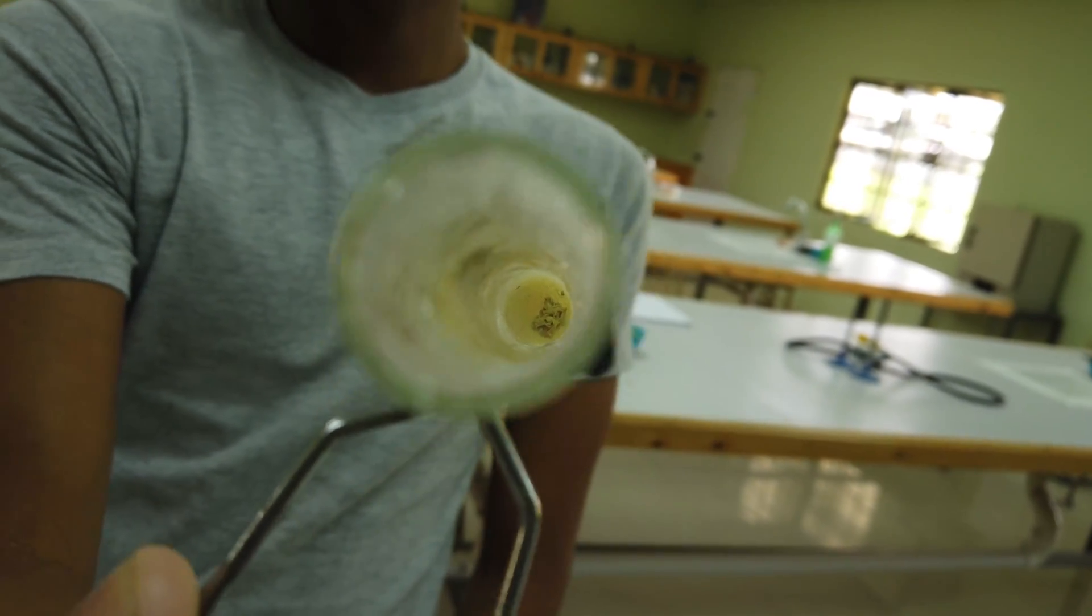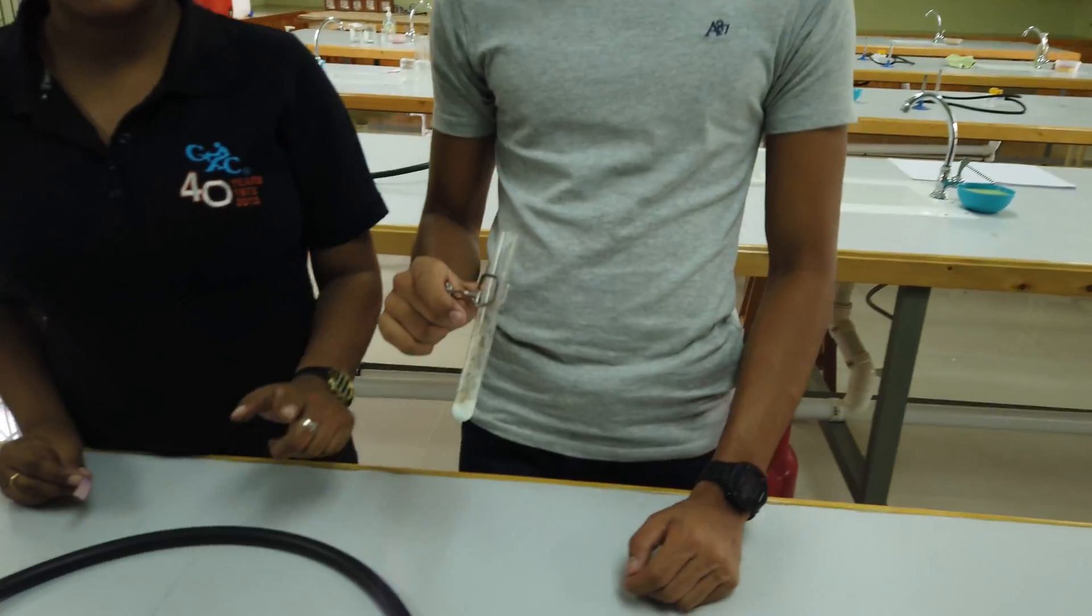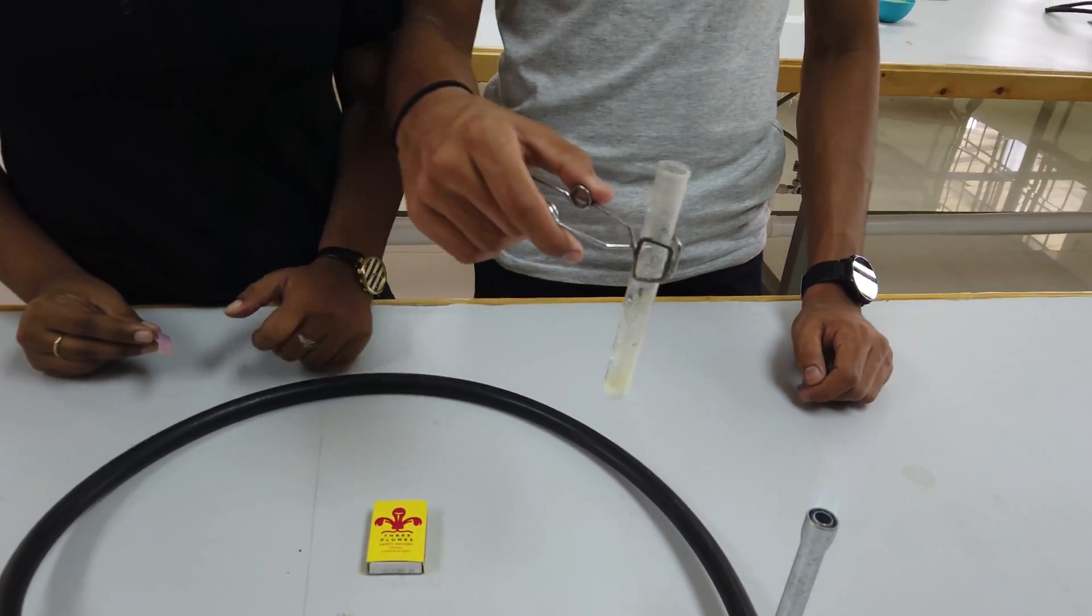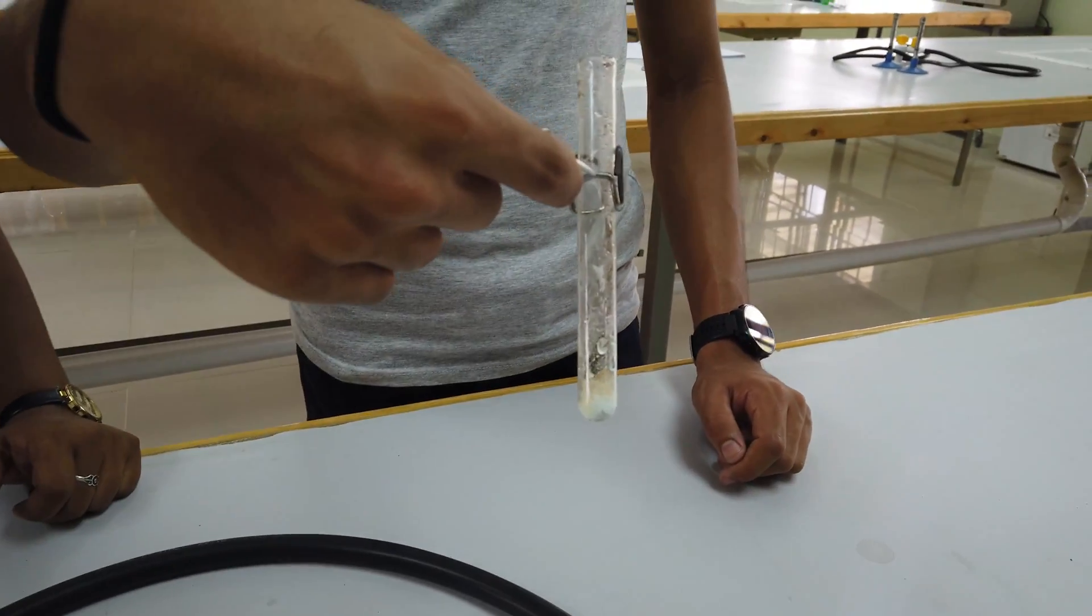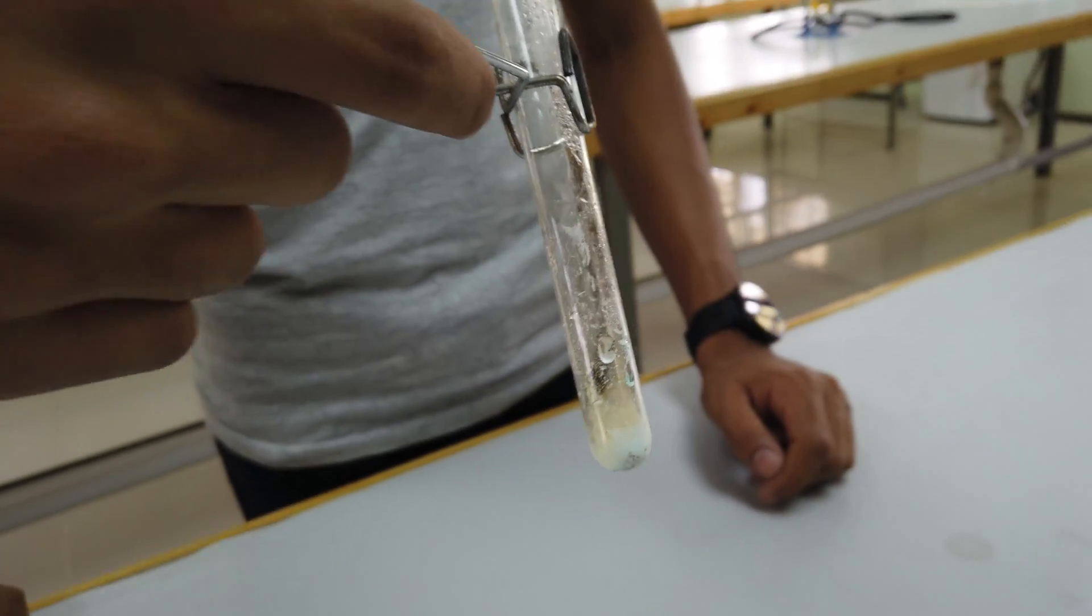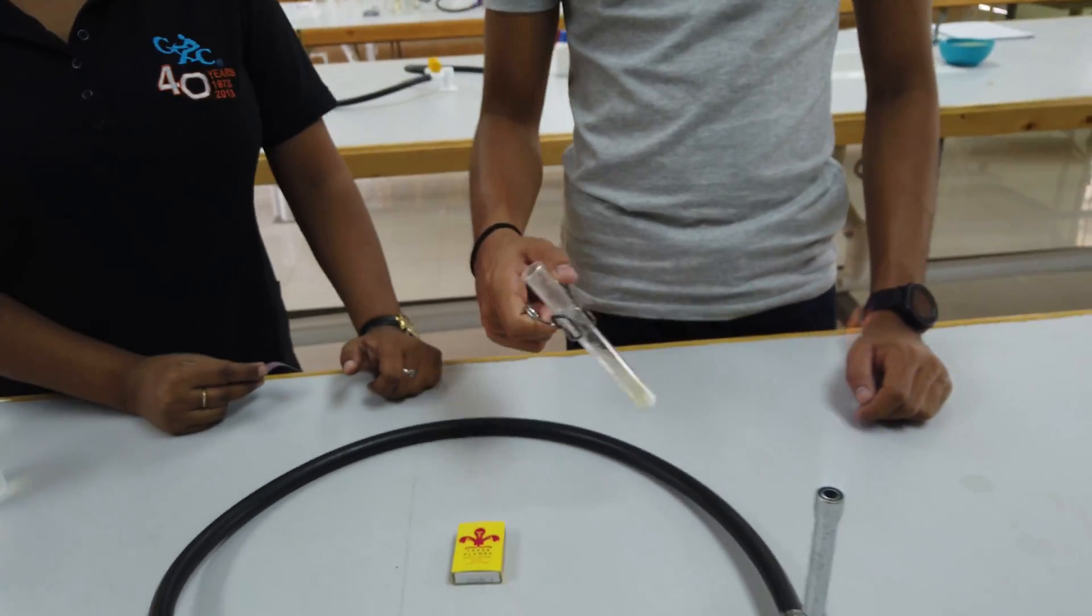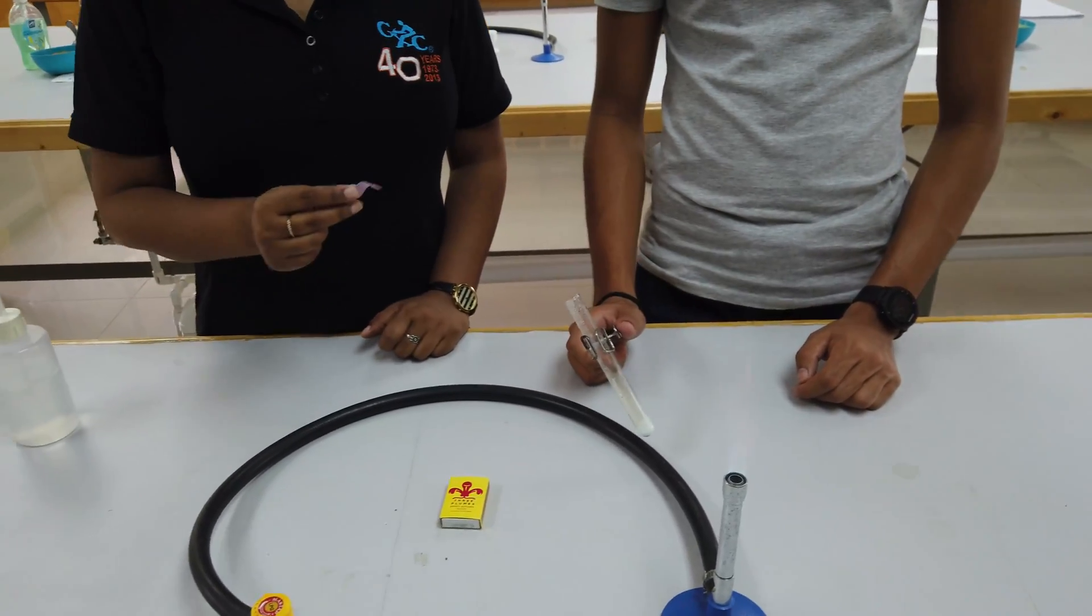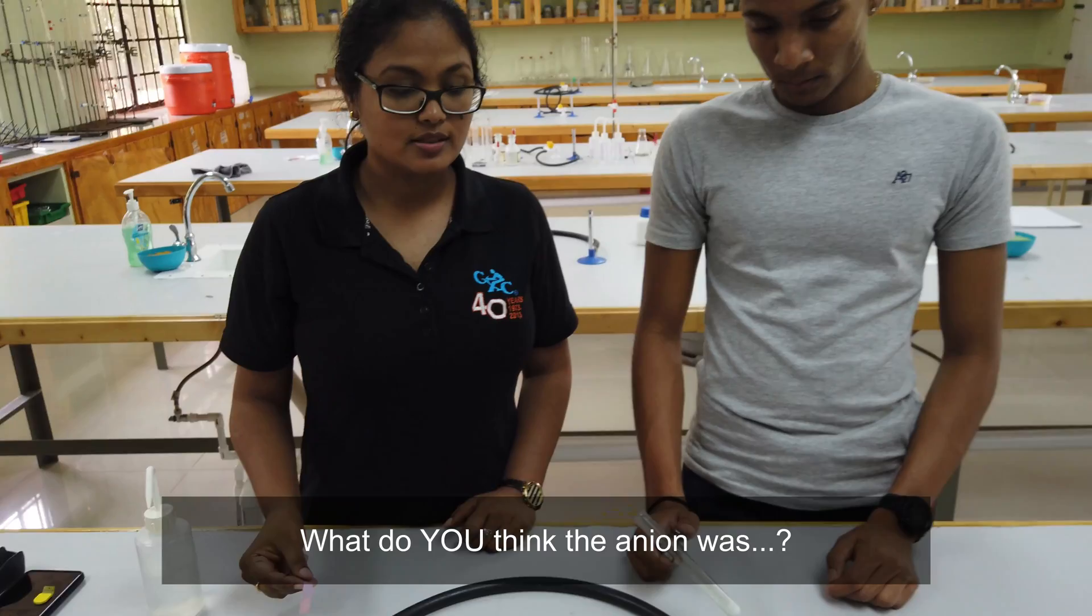You've seen it - there's a stain on the test tube. We're going to put that in our observations as well. Next time I see you, we're going to talk about what anion was present in salt X.